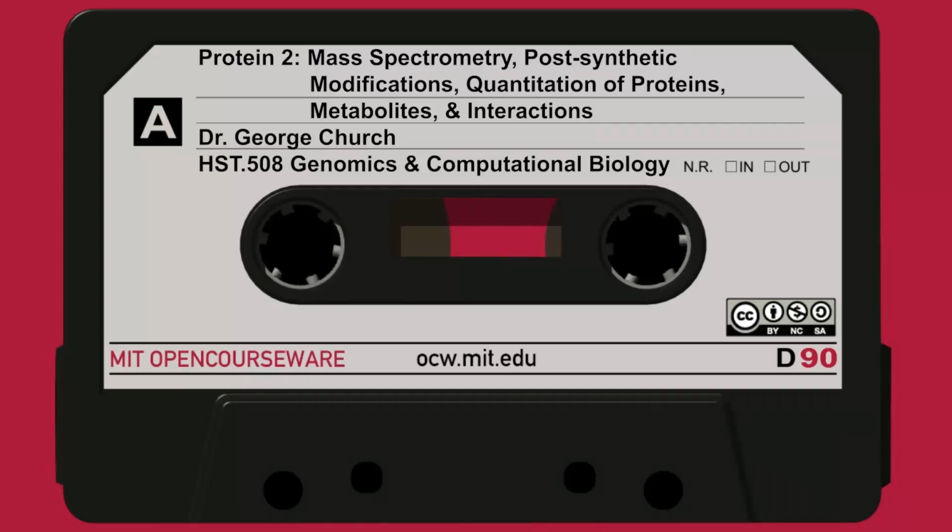So, here is another example of a two-dimensional gel, where the isoelectric point is on the x-axis here, and the vertical axis is this estimate of molecular mass provided by the association of the protein with the SDS micelles and that effect on gel electrophoresis. And this is a 2D gel, a small section of it, not the full pH range nor the full molecular weight range, but this has a good fraction of the proteins that are secreted. Now, to what extent can we calculate this?